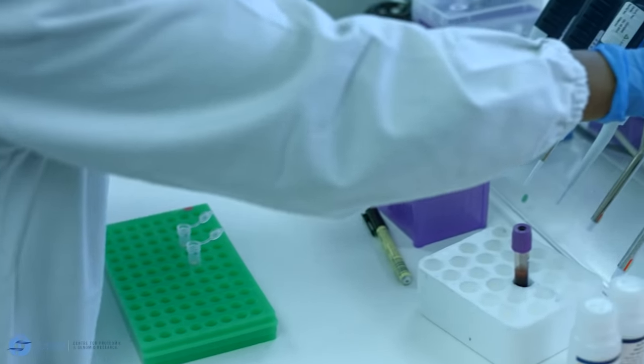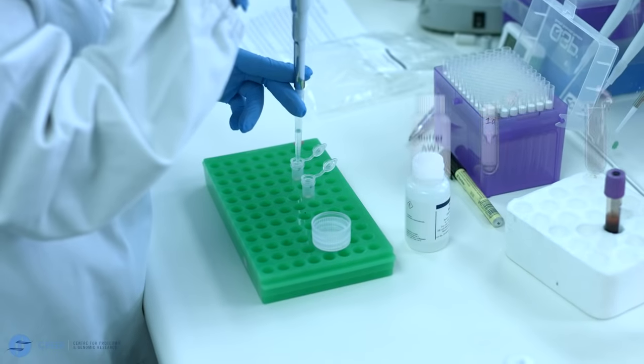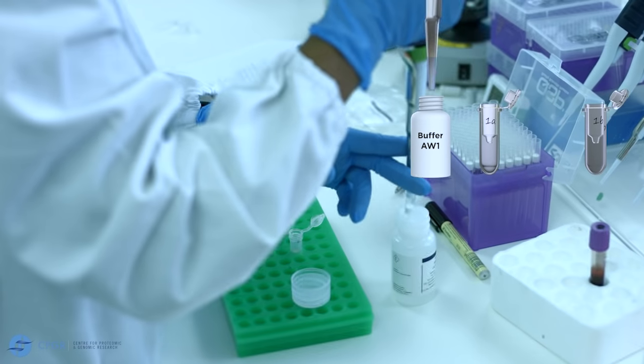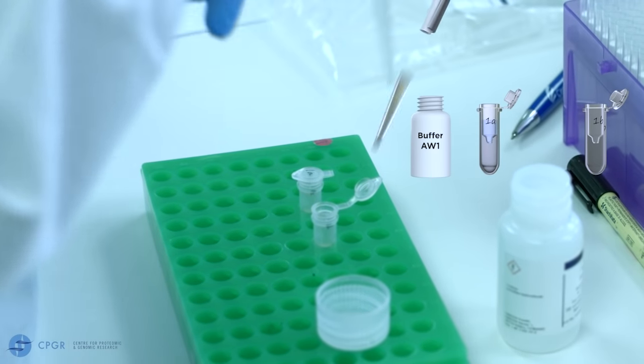Carefully open the spin column and add 500 microliters of AW1 buffer, taking care not to wet the rim. Remember to change your tip between each sample.